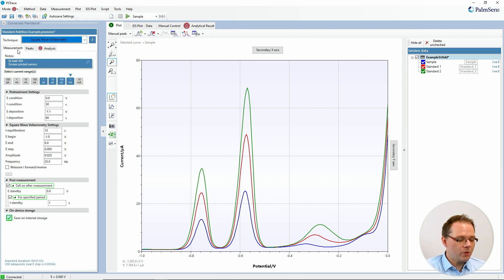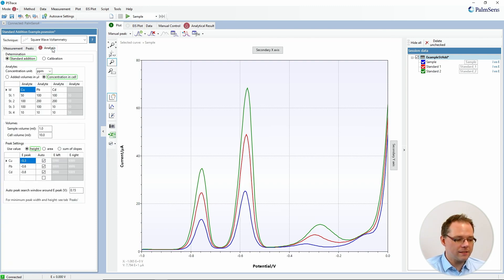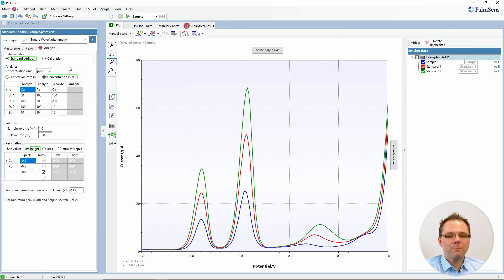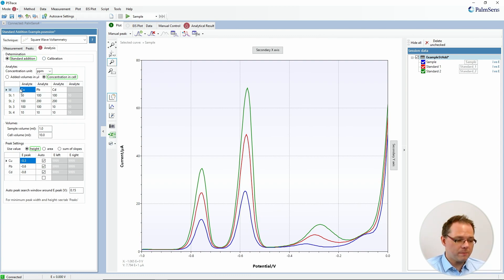First of all, in your method editor you now have a new tab, which is this analysis tab. It allows you, before you perform the measurements, to set all the parameters for your standard addition or calibration curve. Let's just walk through the parameters.